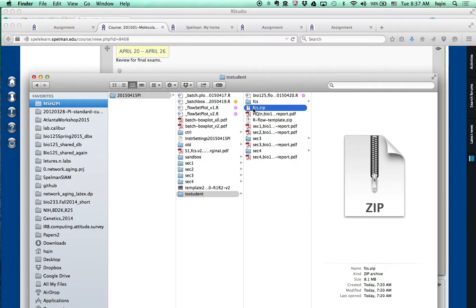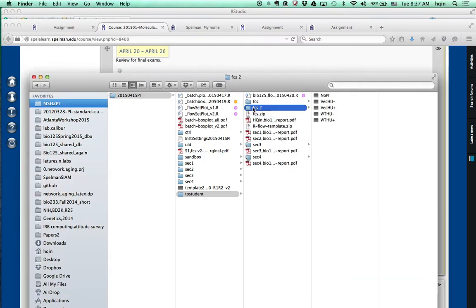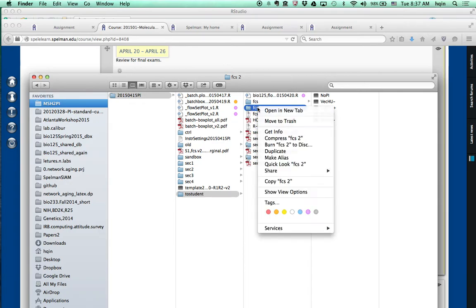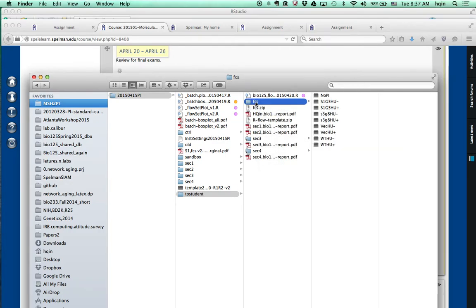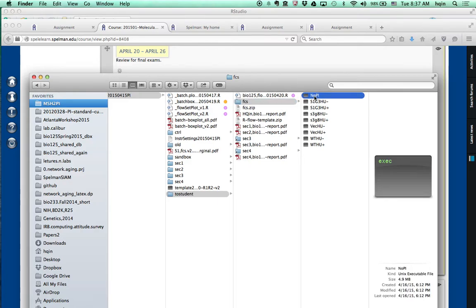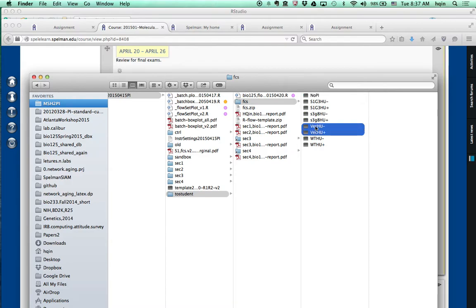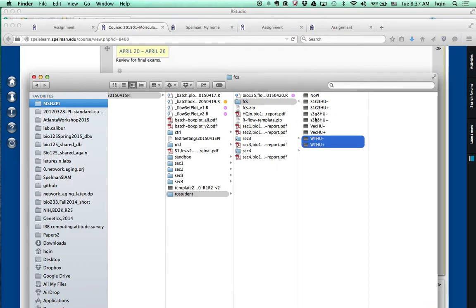You want to unzip the fcs.zip, and then it will bring you to a folder called fcs. Initially, that folder contains only five files: no PI, vector Hu plus minus, and wild type Hu plus minus.